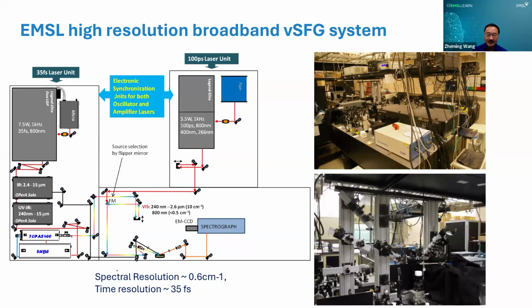that is around 0.6 wave number, while having the temporal resolution of the femtosecond laser of 35 femtoseconds. I believe that these specifications, even up to now, still represent the state of the art in the world.